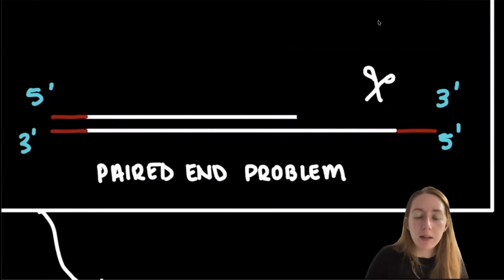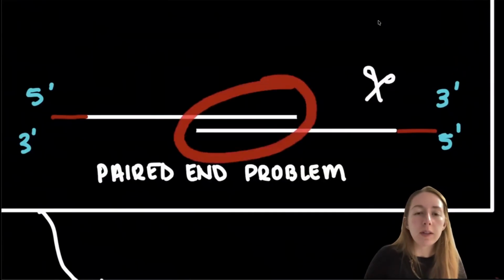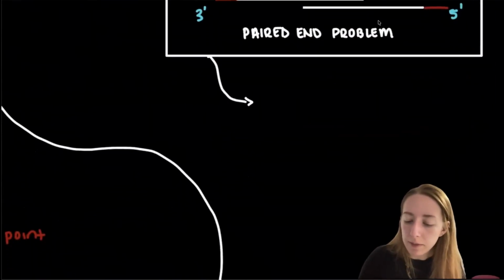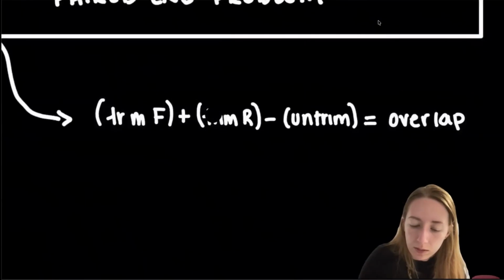So let's trim that portion off, and here we're going to be trimming the end of this one. We want to make sure there's still enough overlap that they can be matched back together. One way to do the math for this, okay, I've accidentally written over that.